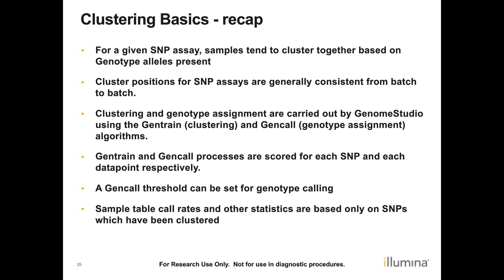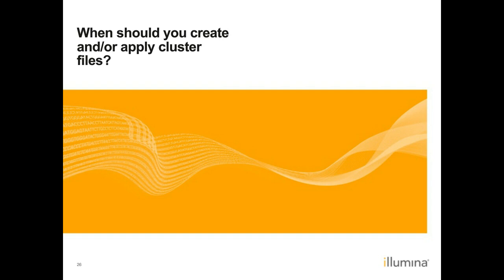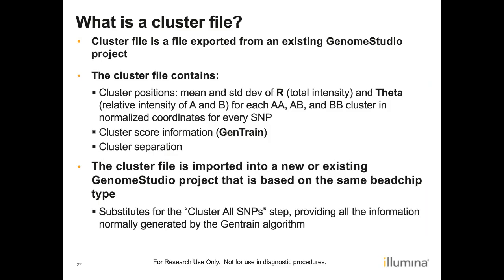So when should you create and/or apply cluster files? Well, what is a cluster file? A cluster file is a file exported from an existing GenomeStudio project that has been clustered. So the cluster file contains all the cluster positions, also includes the mean and standard deviation of the intensity, and the theta for each genotype cluster in the normalized coordinates for every SNP.